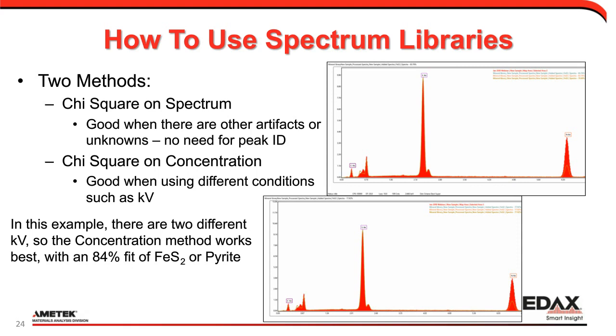Next question is how to correlate the color level with the intensity in a quantitative way. Exactly right. When we look at a quant map, we're looking at colors, and we can't really tell 10% of a color intensity or 40% of a color intensity. So we do provide that marker bar on there, and let me pull up one example of it, and hopefully you can see the slide now.